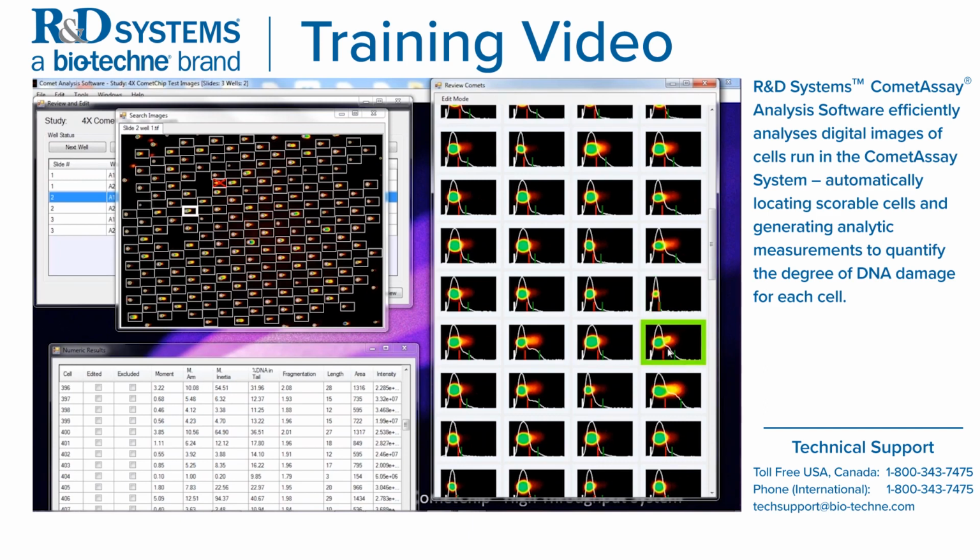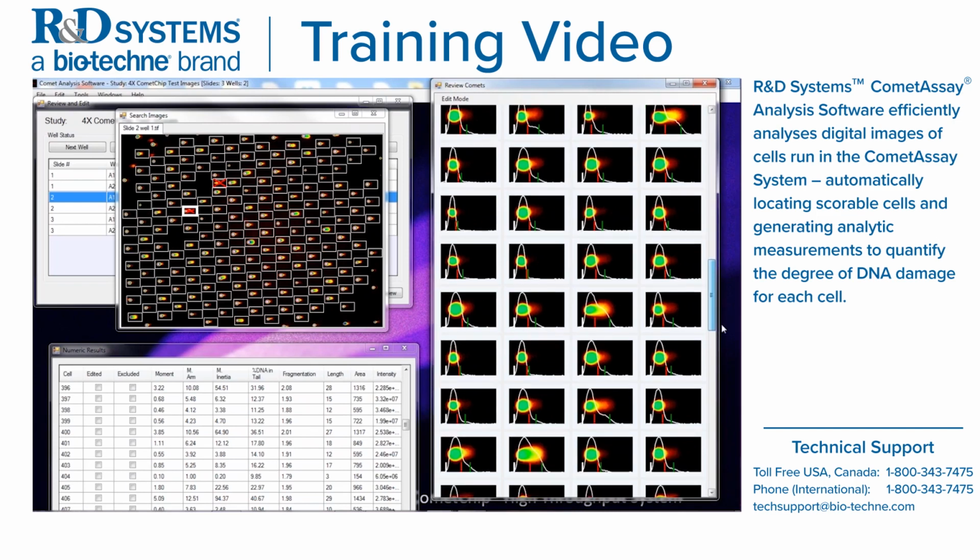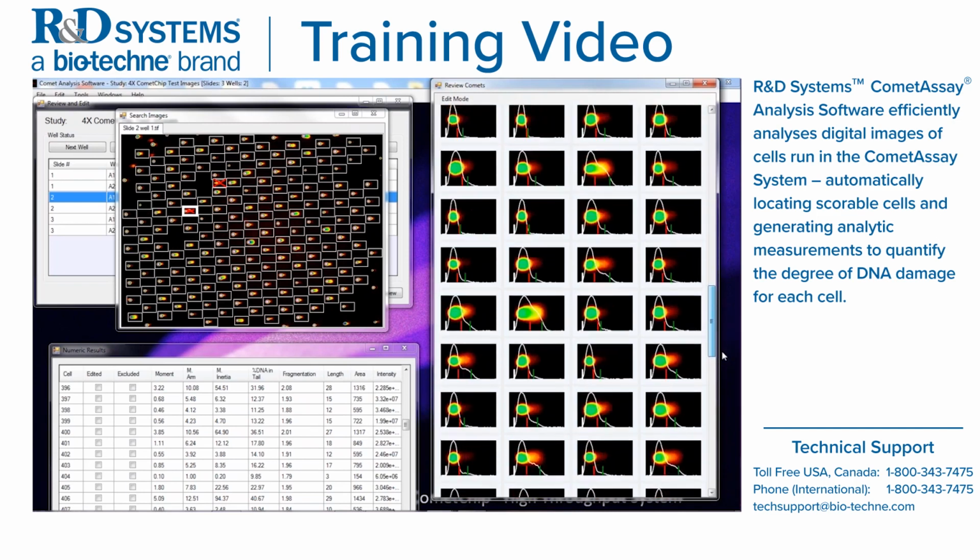We have a comet here that looks strange. We have some type of strange tail, so let's click on this one. I really couldn't see it from the search image window, but I can see it in the review comet, so I'm going to delete that. So I would just right click.